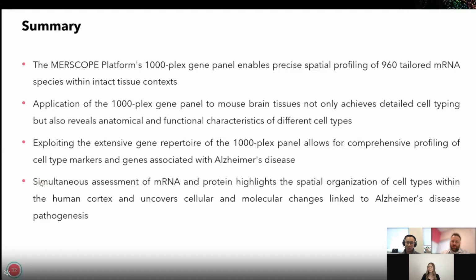Great. Now, do you recommend the use of spatial information when clustering? That's a very interesting question. So far, the analysis I did is first just using the molecular information to cluster, and then to assess the spatial relationship or the correlation between the spatial distribution and the molecular features. But I know there are some algorithms that have been developed that can use both. In my experience, I always find these two are correlated.